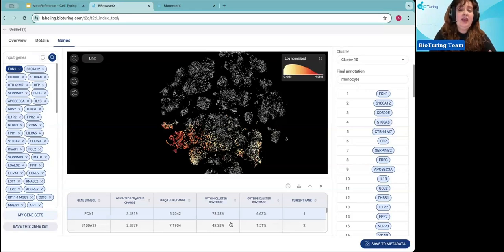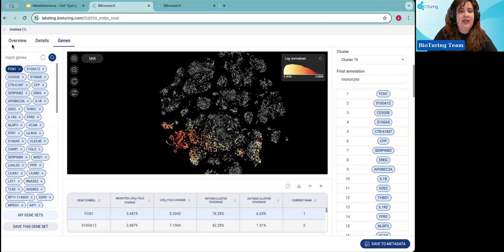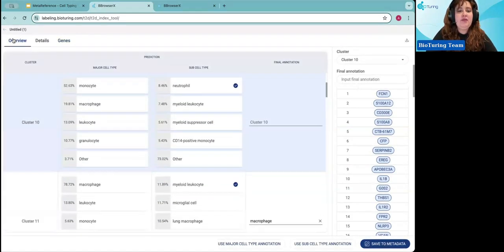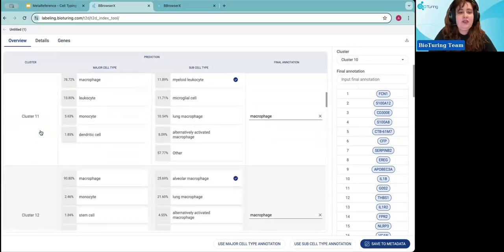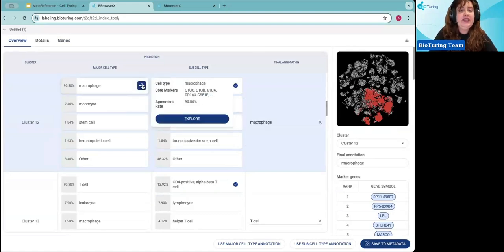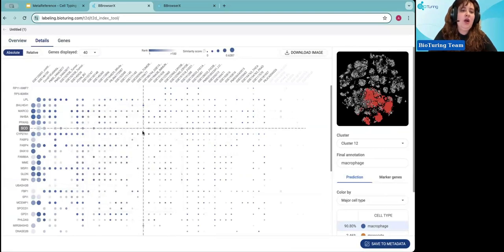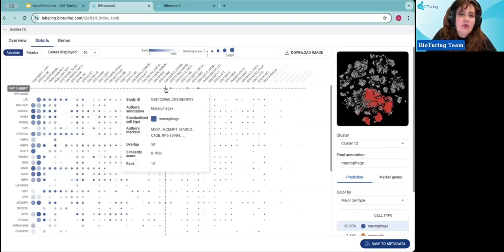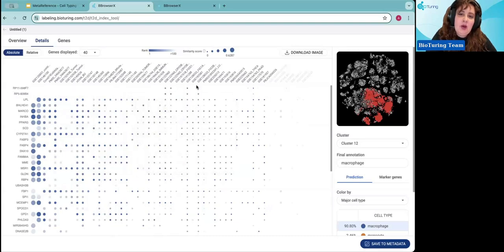From the marker gene list, you can also see references to other datasets in the repository — this is the first step that lets you replicate and validate that this is a monocyte-derived macrophage cluster. Going back to the overview, you can go further. For cluster 12, you can look at what other datasets show at that percentage agreement rate by clicking on the major cell type and then Explore — this gives you details across other datasets providing the same annotation information.